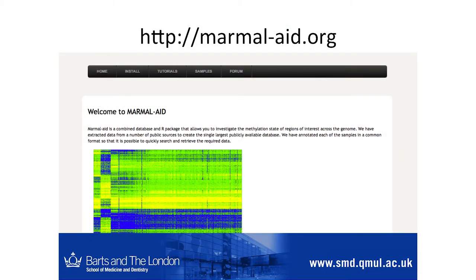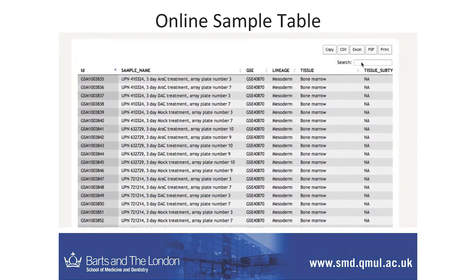I know some people here have used Marmalade. We've just made a massive update to the front end — the website — and hopefully it's a lot cleaner and a little bit easier to use based on some comments. One of the big enhancements is this online sample table. In the top we have a search field where you can put in all sorts of things you're interested in, and this will dynamically update — really useful. So if you're just interested in blood, you can quickly find all the blood samples, export the dataset, and use those identifiers to input into R.